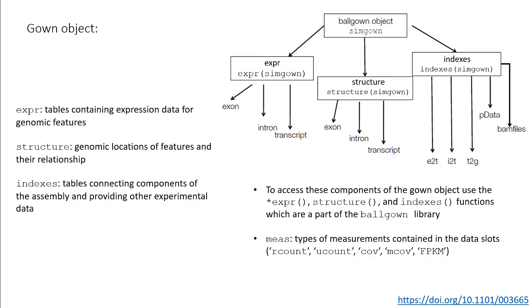In order to access these three components of the gown object, the ballgown package has three functions which take the gown object as an input. For each function, you can specify what unit of measure you'd like to display using the meas parameter.